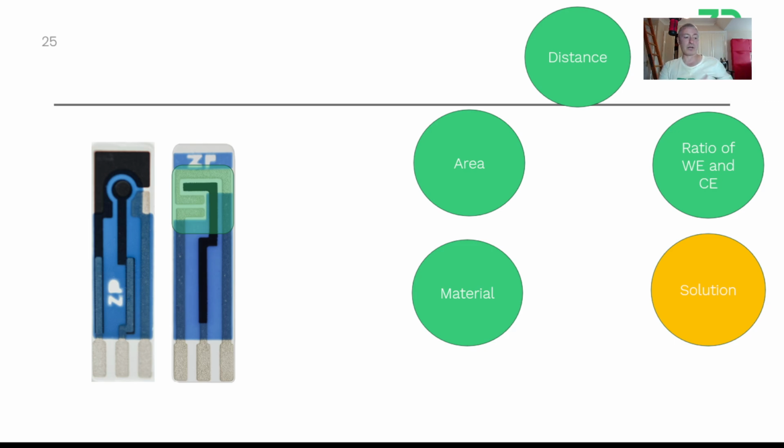A question that I would ask most people is, what's your counter electrode doing? And actually they don't know. What it's often doing could be reducing oxygen, but there's only 6 ppm, 6 parts per million, of oxygen in the solution, so that can be quickly exhausted. Or it's possibly doing the hydrolysis of water, which I think is a bit of a disaster because you're starting to introduce bubbles onto your electrode system.